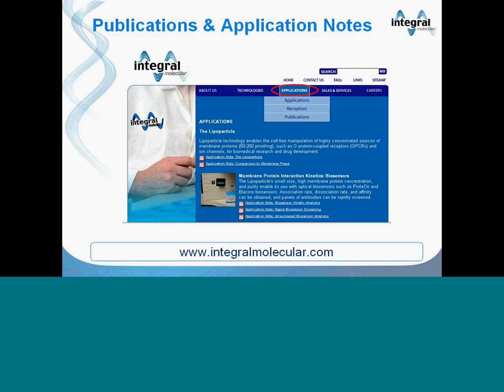in the antibody binding. So what is the lowest molecular weight ligand you've looked at in terms of binding to the receptor expressed in lipoparticles? Right. A majority of our studies have focused on antibody binding.